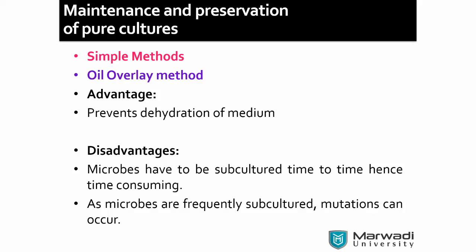Right? So it is like a low temperature. After a certain time period it may start. So the temperature may be at 15 to 20 or 25 when they start. So whatever ice has formed and crystallized gets melted down. And within the melting, the water vapor is taken up and collected, pulled down to the bottom.